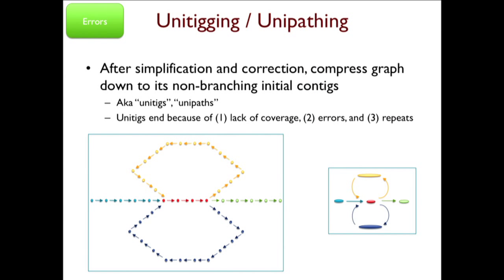So now that we've done enough sequencing, we've oversampled the genome by a lot, we can follow that same algorithm that Dickens had shown you. We're going to take the sequences, chop them up into subsequences, compare them to each other, keep track of all these relationships. That's going to build together some sort of initial de Bruijn graph or initial assembly graph. We can compress this down to build up our initial set of contigs.